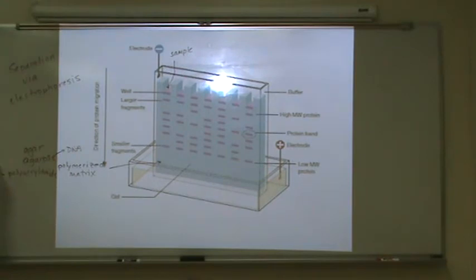Proteins normally use polyacrylamide gel. At King, so far I'm not using polyacrylamide gels in cell lab because it's fairly toxic stuff. I also need to practice pouring them because it's tricky to pour them. It's also toxic. I also haven't done it in a while, so next year I might try it. We also don't have the right equipment to run polyacrylamide gels.